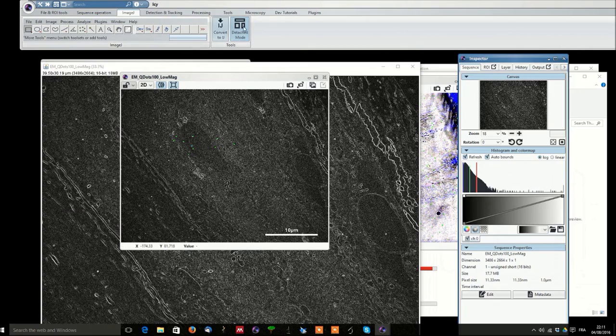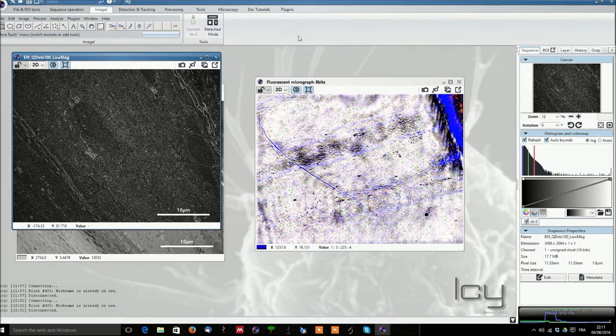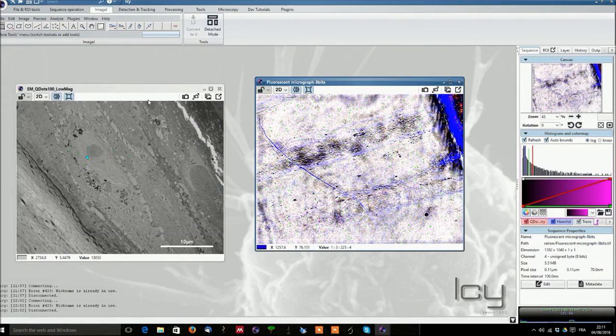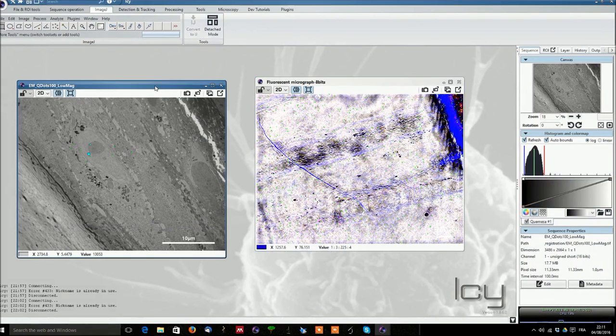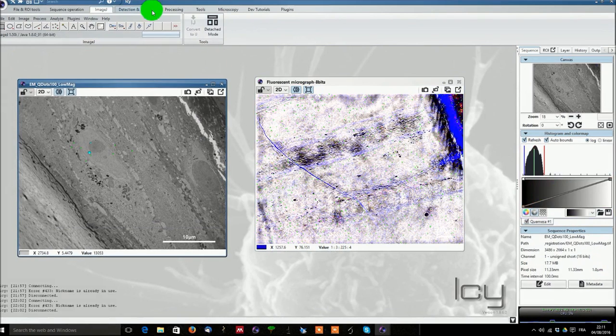Now from there we will just go back into attached mode because this is most convenient and we can switch off this image that we are not interested for the moment.